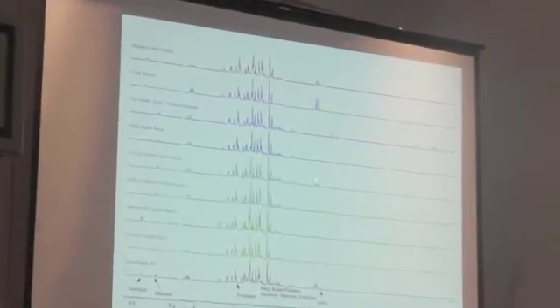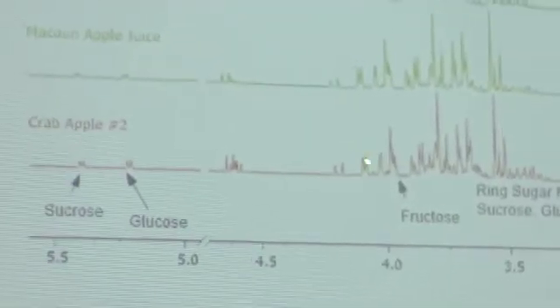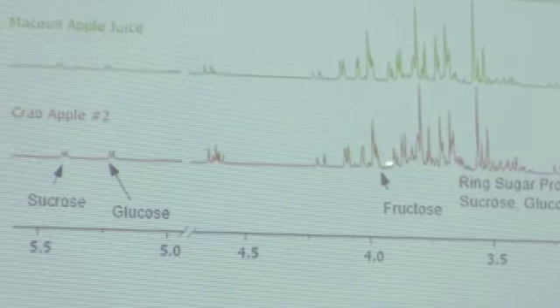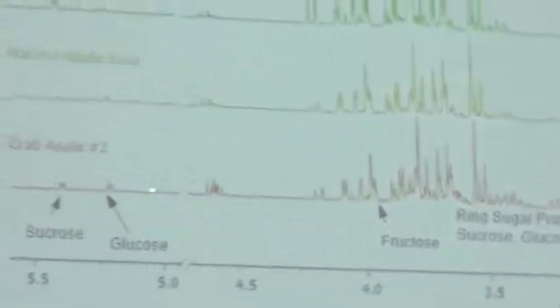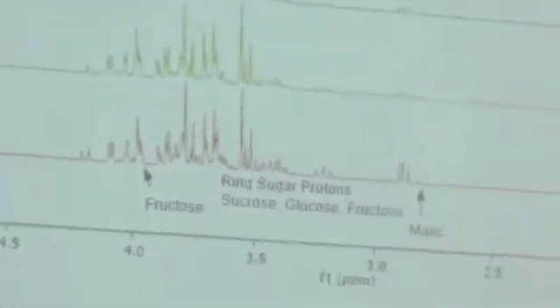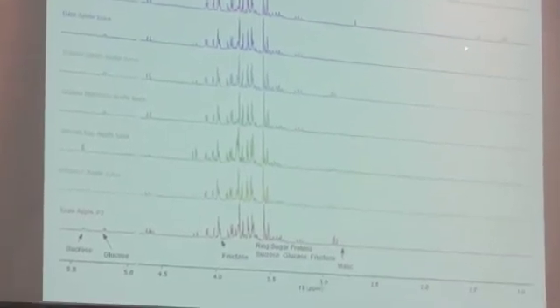So when you look at an apple juice, you always see sucrose, glucose. In here, these 3 groups of peaks are fructose. All the rest of this is glucose, fructose, and sucrose, but we use certain peaks in here to quantify it. This peak's your malic acid. This juice was from a Fuji apple that we left over the weekend, and we pressed the juice and just let it sit there, and so malolactic took off, and it completely lost all its malic and went to lactic, and it made some ethanol, and it made 2,3-butanediol. There's a lot of bacterial stuff going on with that one.